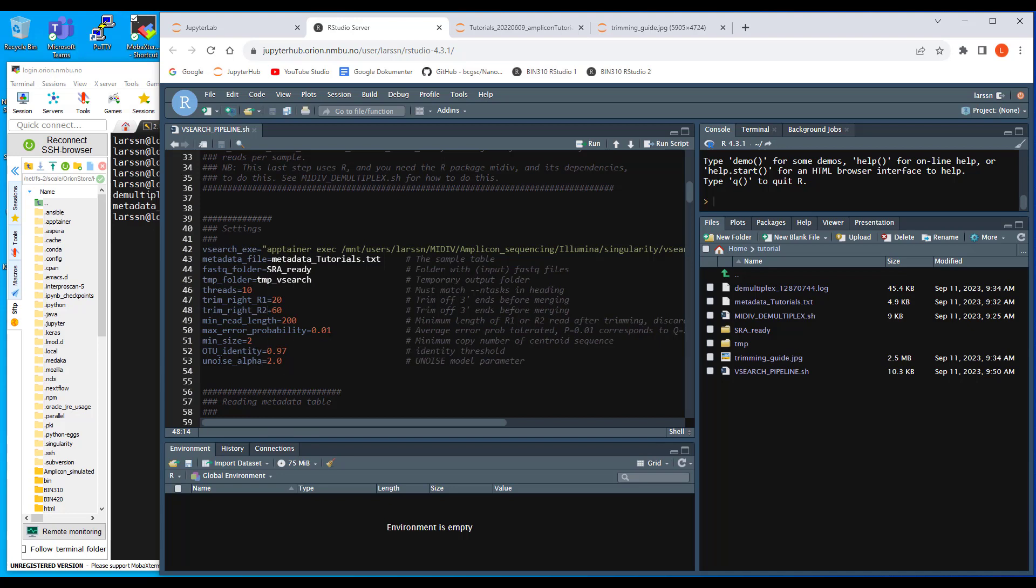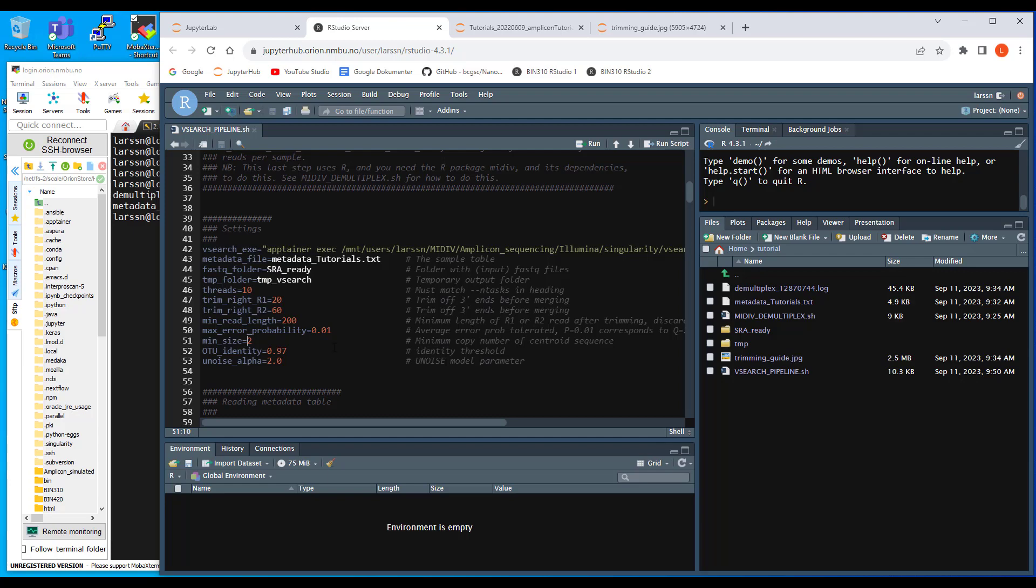Apart from that, I don't think you need to change much here. The min size here is a two and that's a default. You can go higher than two, but you should never go down to one. This is the minimum copy number for the centroid sequence in each OTU, so you should at least see two copies.